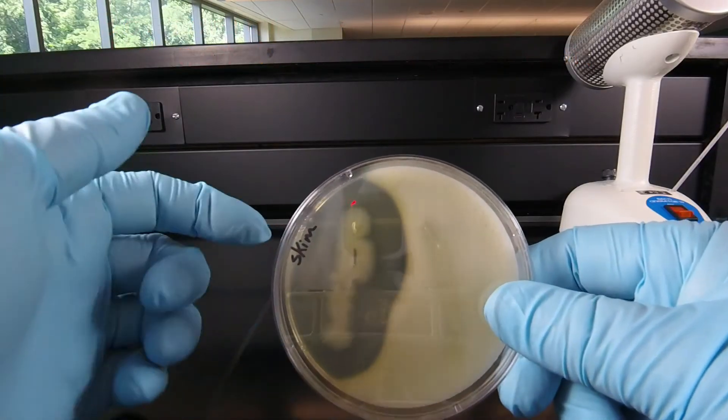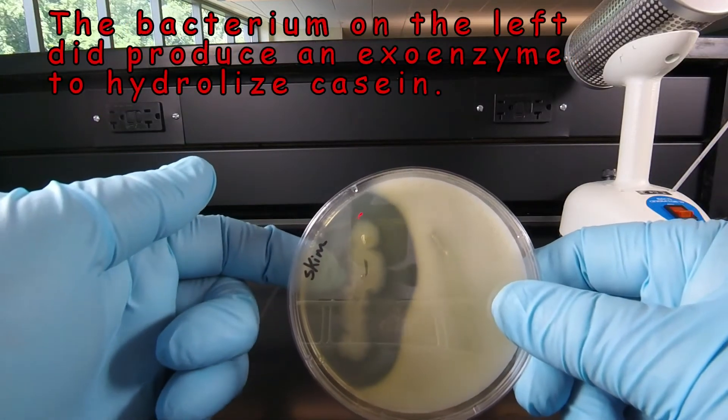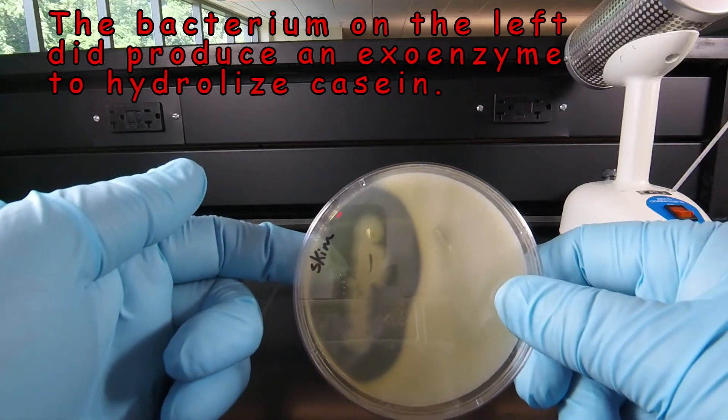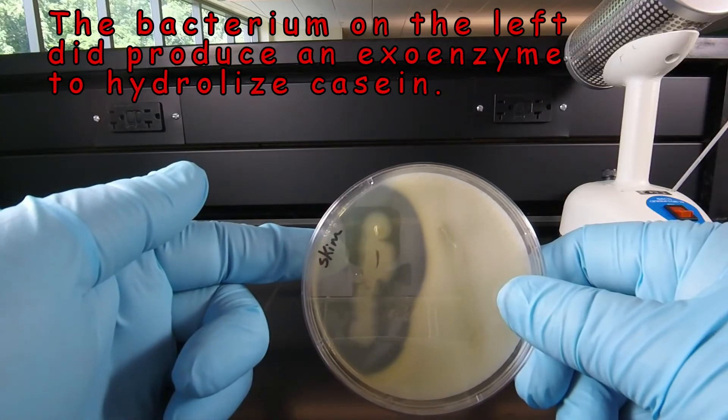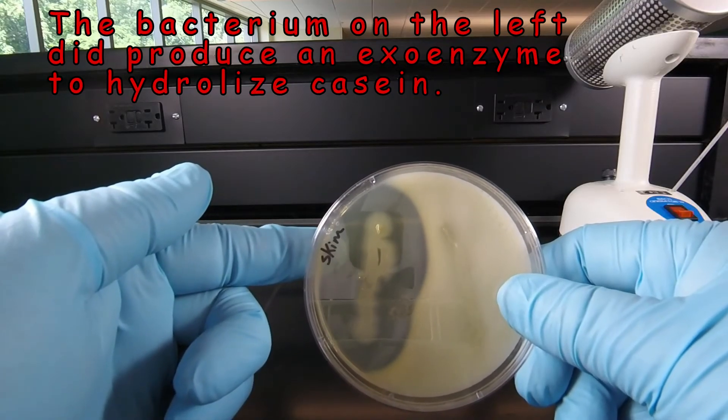On the other hand, the organism on the left did hydrolyze casein. We can see the casein has been hydrolyzed or broken down, and the agar turns clear when the casein is no longer there.